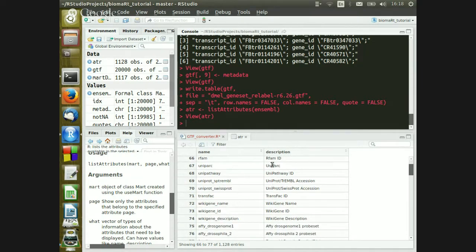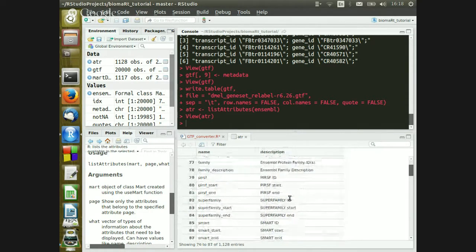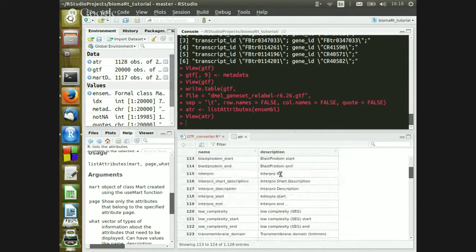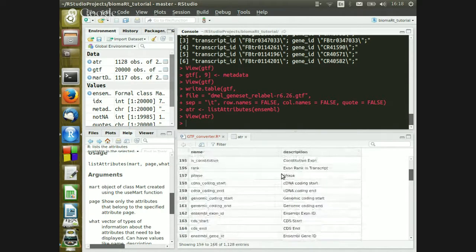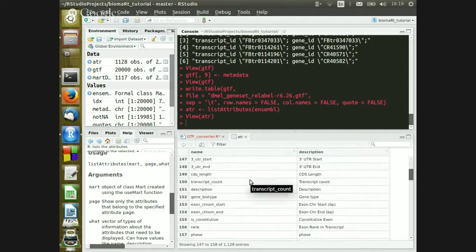Basically, it's got all of these different accession numbers for all these different databases. One thing that's useful is that there might be NCBI stuff in here somewhere; you've got to look. At least it's a good way to figure out, if you need an ID from one database, how to get the identifier for it with biomaRt. Any additional questions before I terminate the web stream and close down for today? Sweet. Okay, let's turn this off.